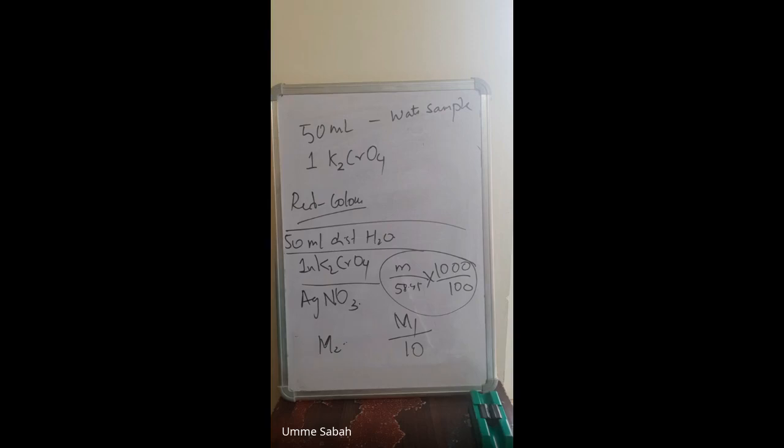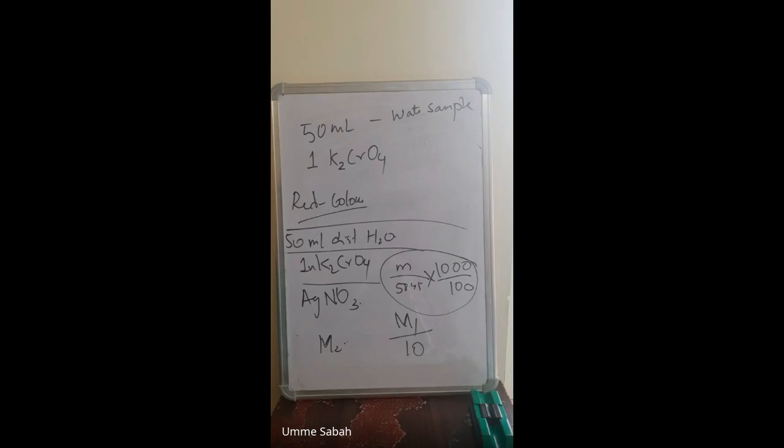Standardization of silver nitrate solution. How much volume of sodium chloride did you take? 10 ml. Yes or no? Yes, ma'am. 10 ml of sodium chloride you have taken. Molarity of sodium chloride is M2, what you calculated here. That you have to note down there.